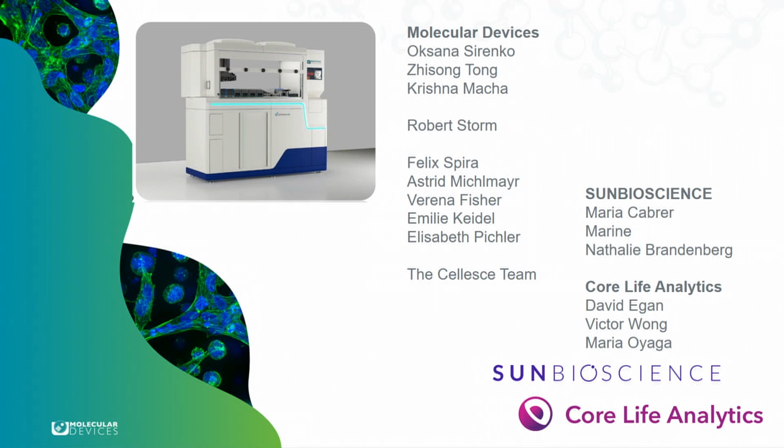Hi. Thank you very much for the presentation. I think you showed nicely how, on one side, you can scale the production, and then on the other side you also have nice equipment, instruments and software to have a look at what's going on during the assay. My question is about the middle part, so during the assay itself, you also need a platform to do that. And you showed, I think, two examples now. One is microwell plates, and the other one just a well plate with a matrigel layer or a dome. And I wonder, what is your opinion about that? Is there room for improvement in that section as well? Especially if you mass produce organoids, that you have a good culture vessel, that you have them maybe homogeneously distributed, maybe quite in the same focal plane, maybe without matrigel, so that they can easily be retrieved or accessed. So I just wonder what your opinion is.